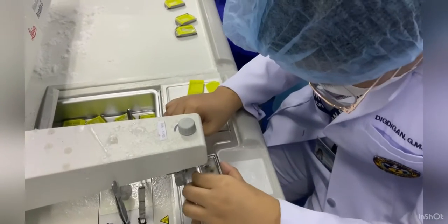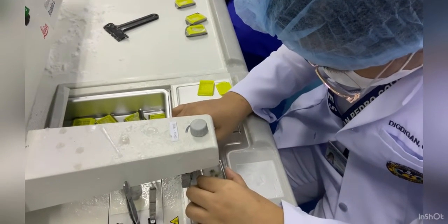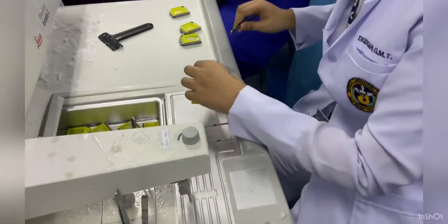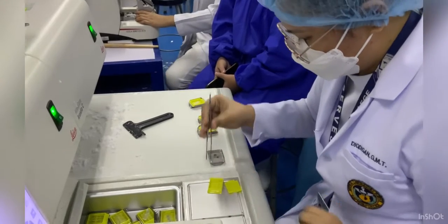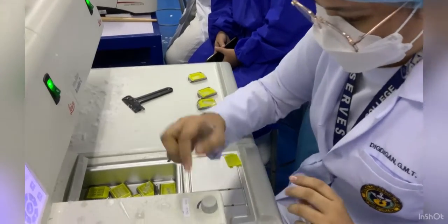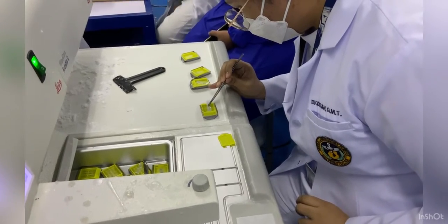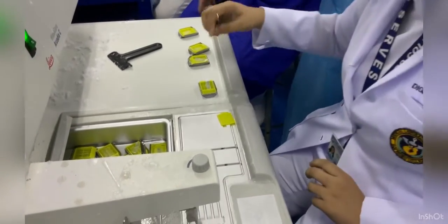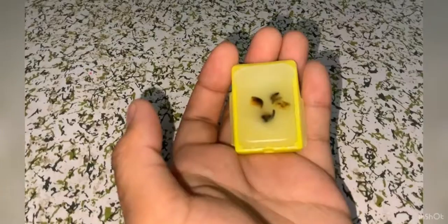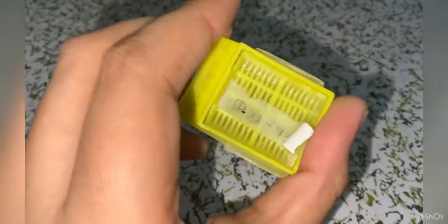Next is to finally fill up the mold with paraffin wax. Then wait for it to solidify. Don't forget to put the cassette and the accession number on top. Finally, it's solidified, and this is what we call the tissue block.